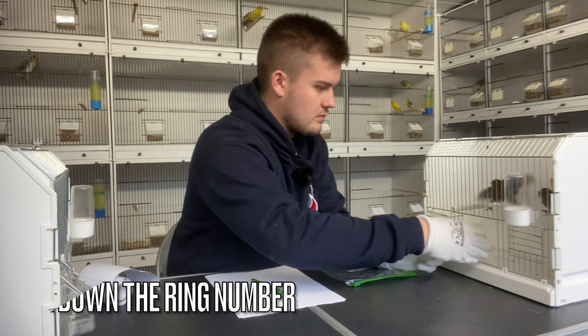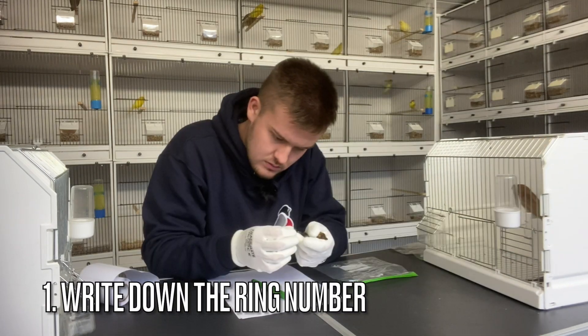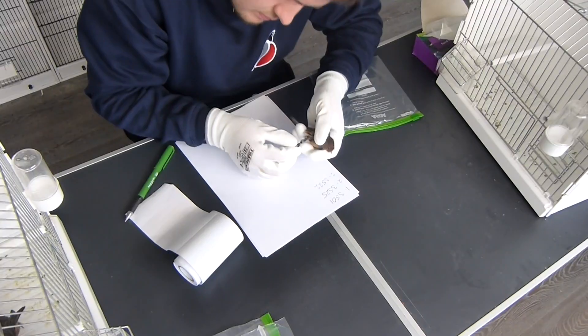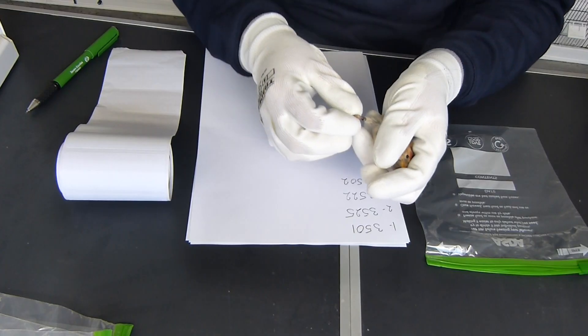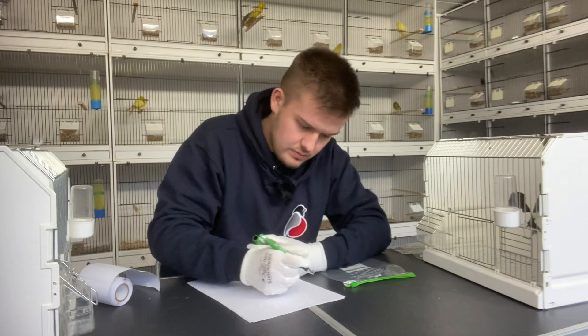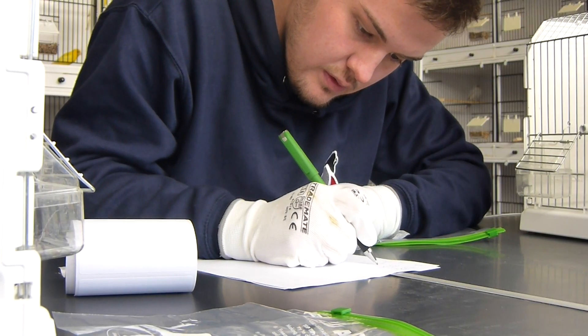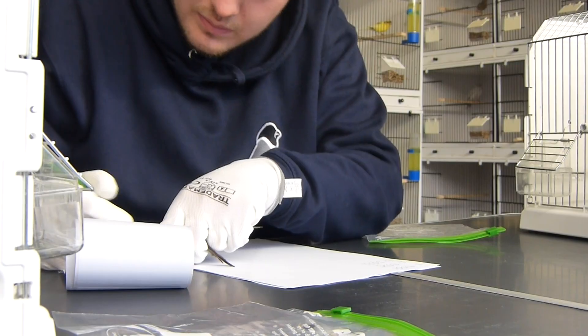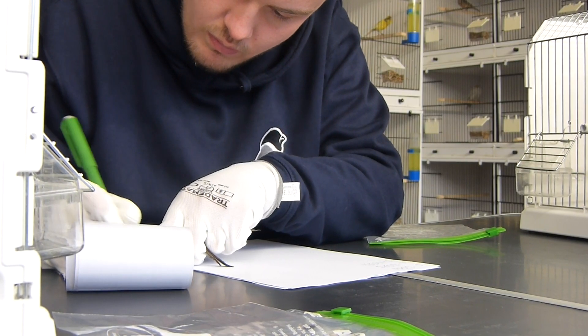The first step is to get the ring numbers of the birds. Each sample needs to have a specific way of identifying it, and your ring number is a unique way of identifying each bird. You're going to make a note of that on your piece of paper and also on your labels, so you can label each sample with the specific ring number of that bird.